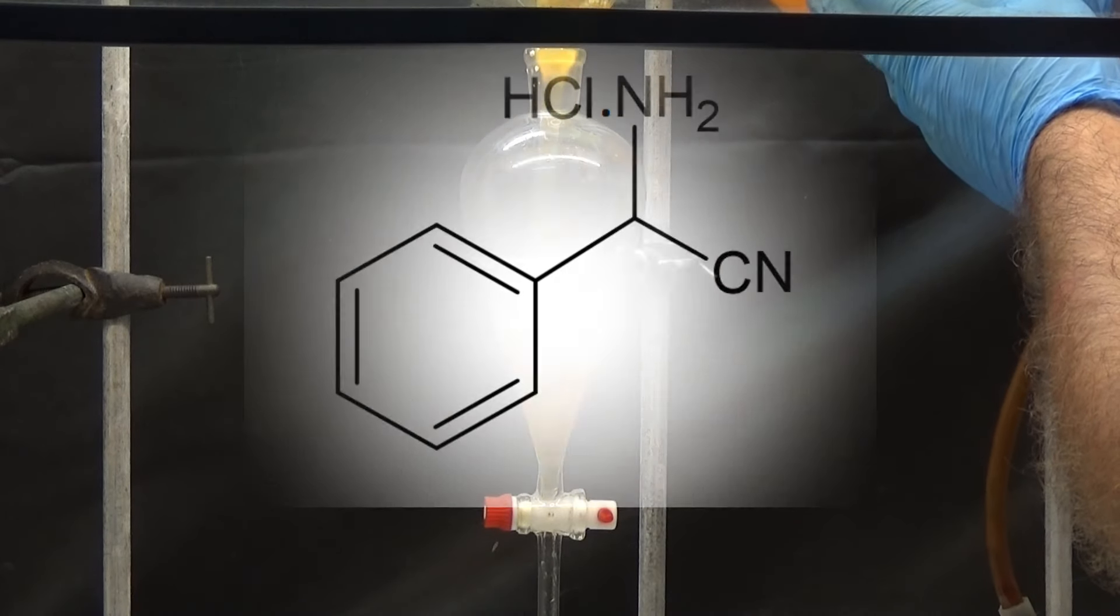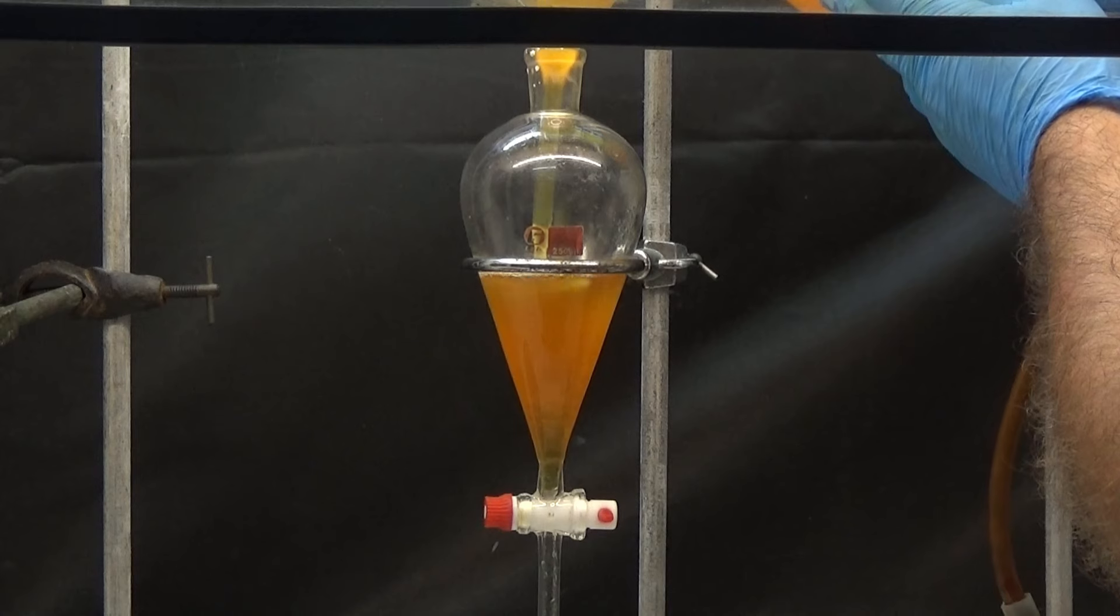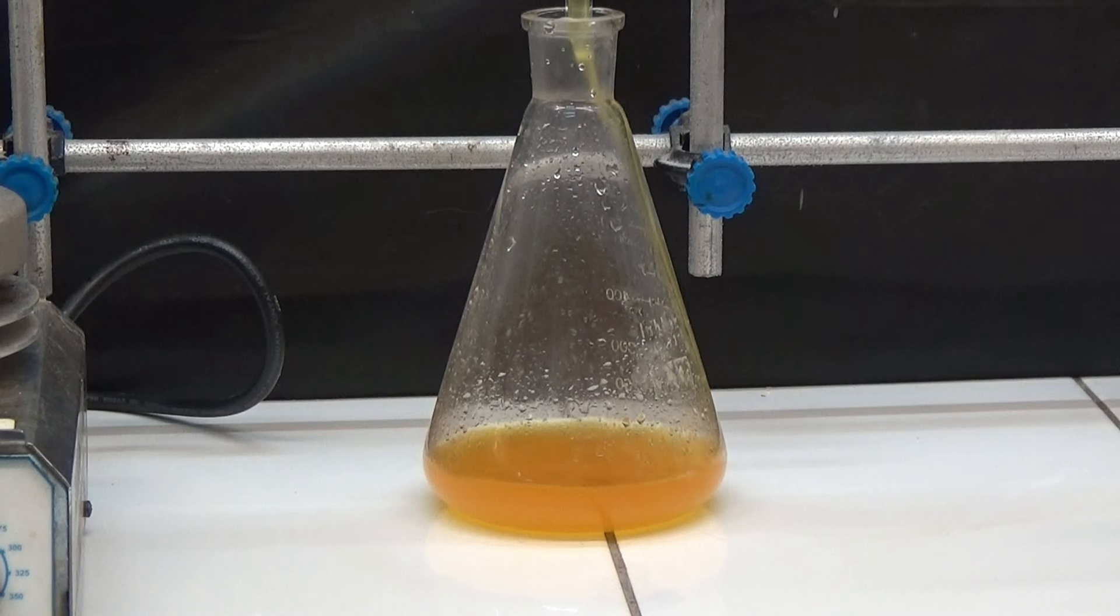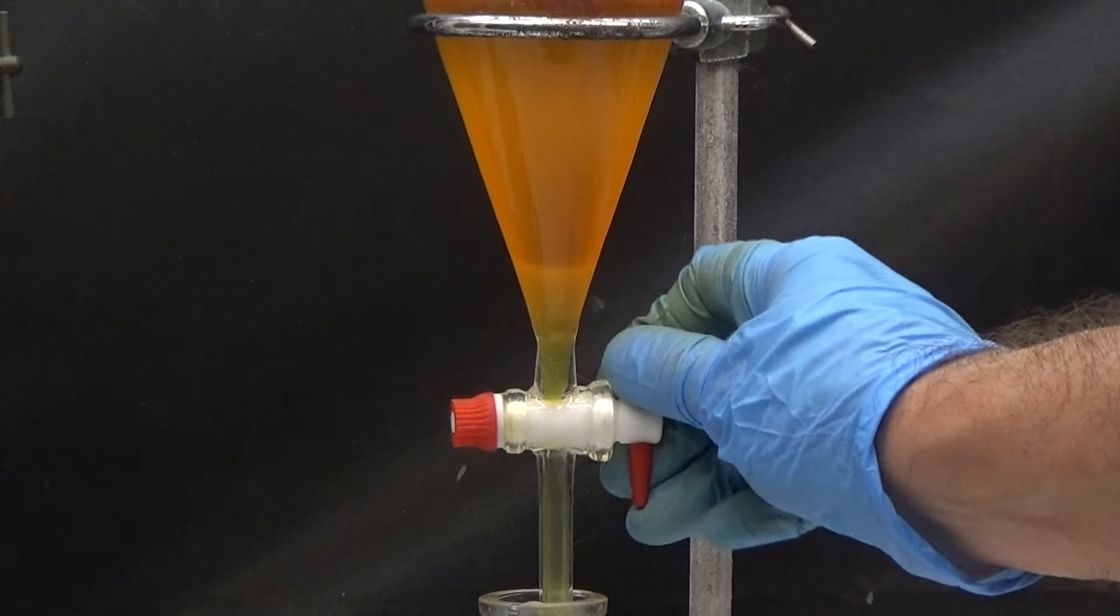We separate the aqueous phase that contains aminonitrile hydrochloride. The organic phase containing other materials is discarded to distill and recover the toluene.